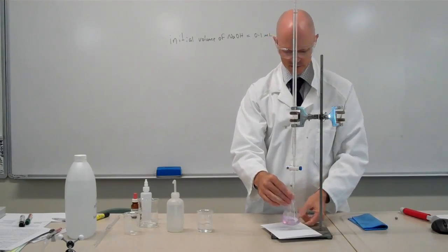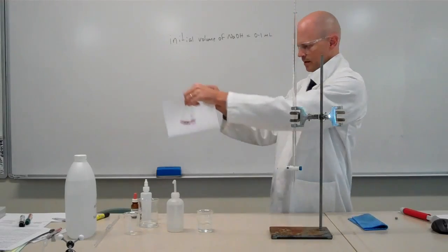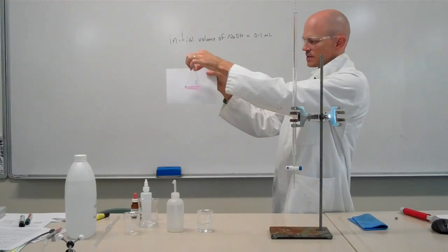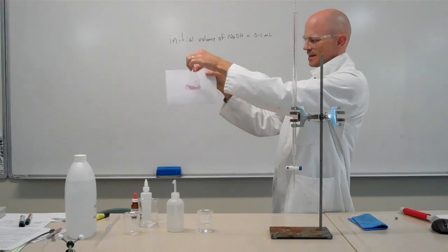One more drop will do. There I have got a definite pink colour, which means that I have reached my equivalence point for this titration, which will be explained at a later stage.